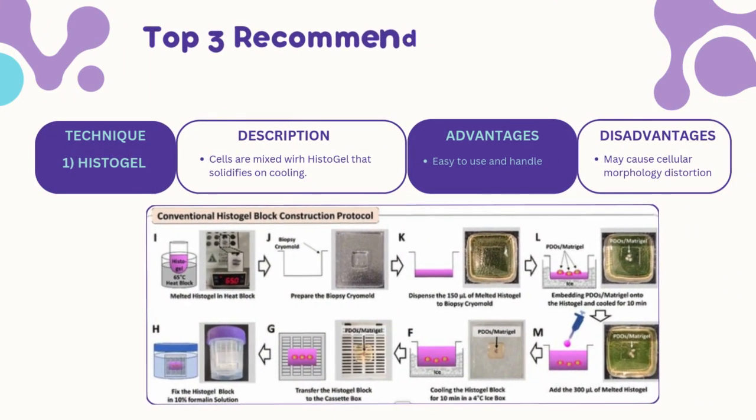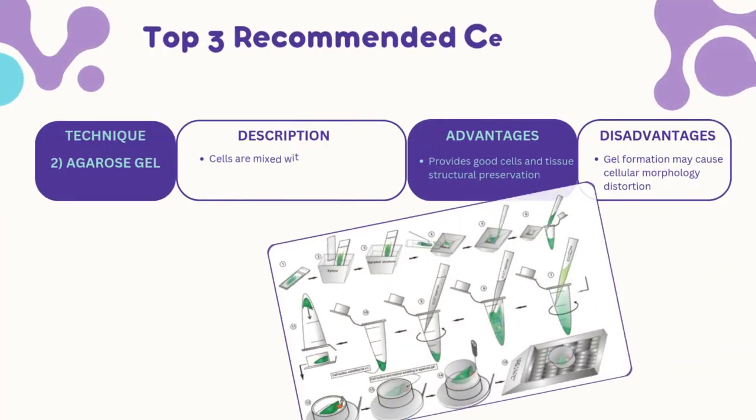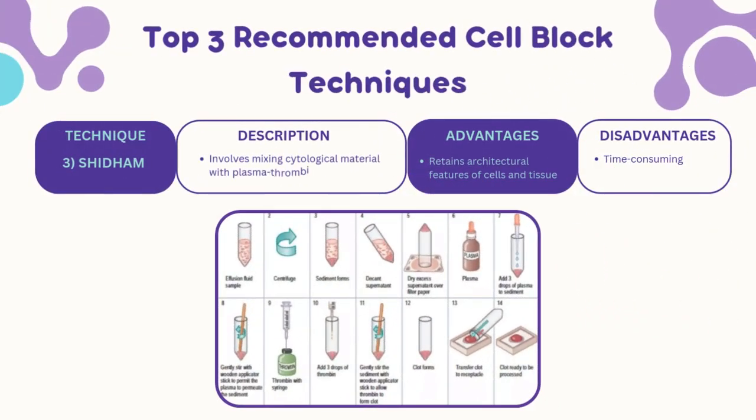Here are top 3 recommended cell block techniques to be used. The first one is histogel. Secondly, agarose gel technique. And the final technique is Shidham technique.